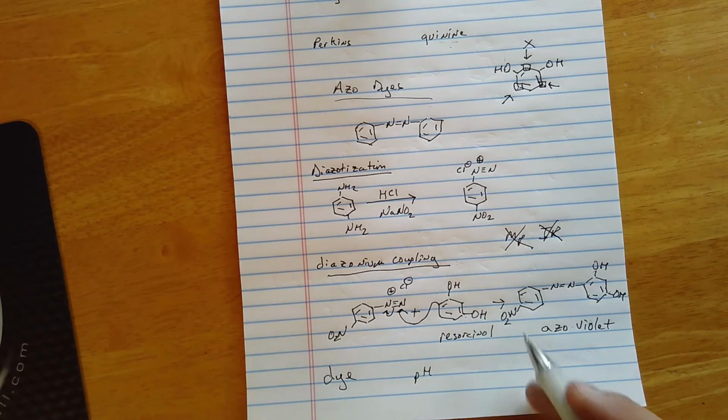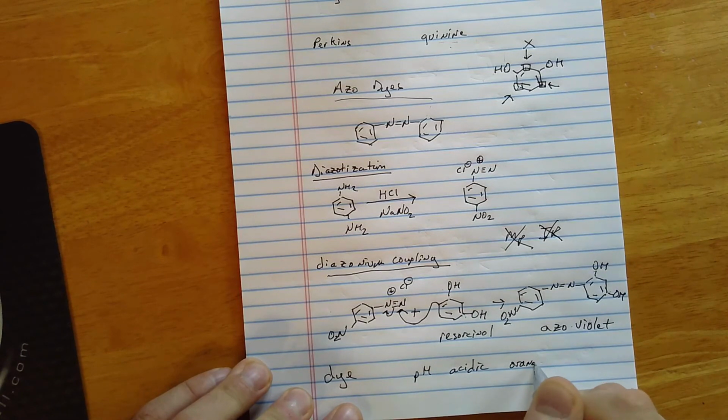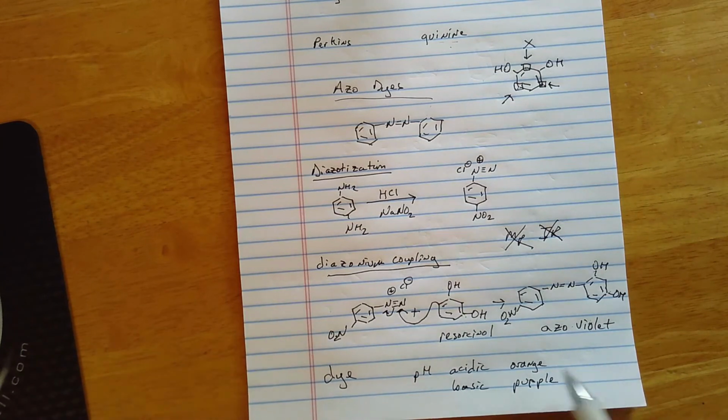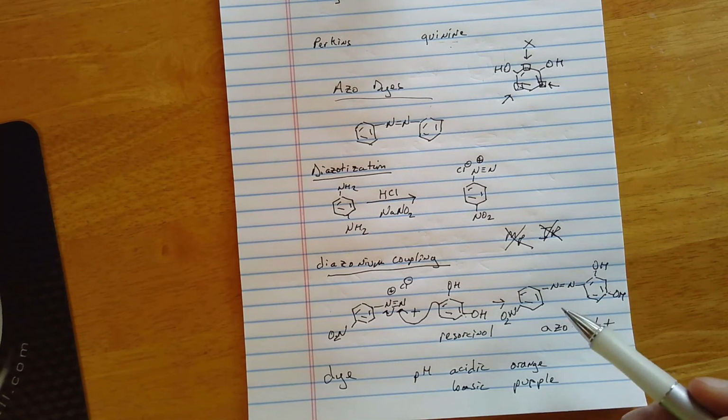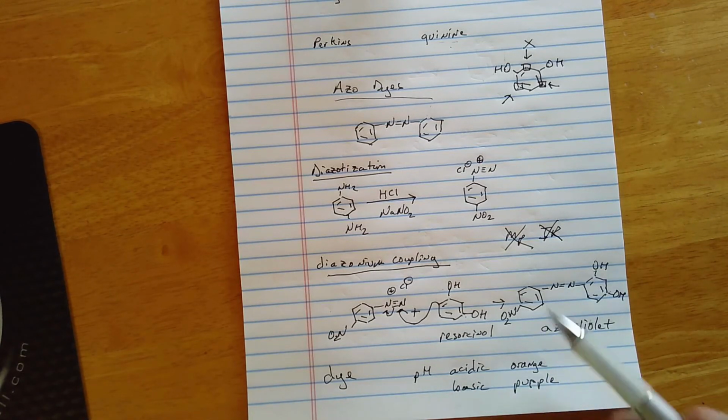Many azo dyes have different colors depending upon the pH. And azo violet is no different here. So under acidic conditions, azo violet is orange. And under basic conditions, azo violet is purple. So we're simply going to see, does our product turn purple under basic conditions and remain orange under acidic conditions?